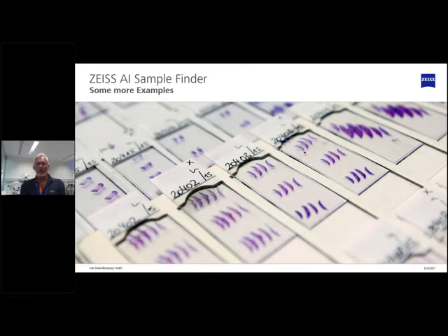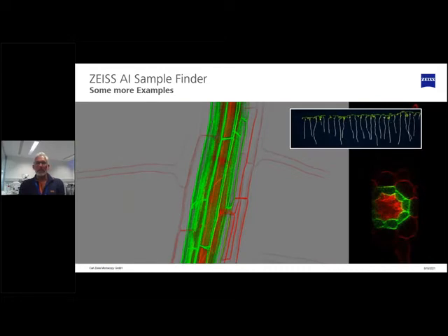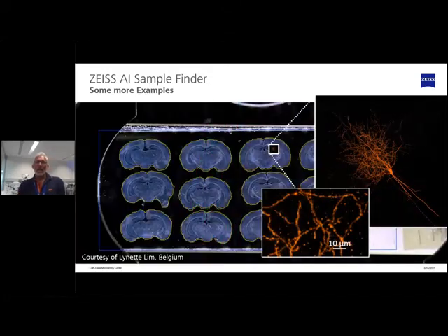So this helps. If you look at samples like this, everybody knows these neatly stacked embryos, side by side. We can clearly identify them and take the locate mode again to travel, but it's much easier if you get them detected and you just need your screen to go to the next and next and next and apply the imaging settings to them.